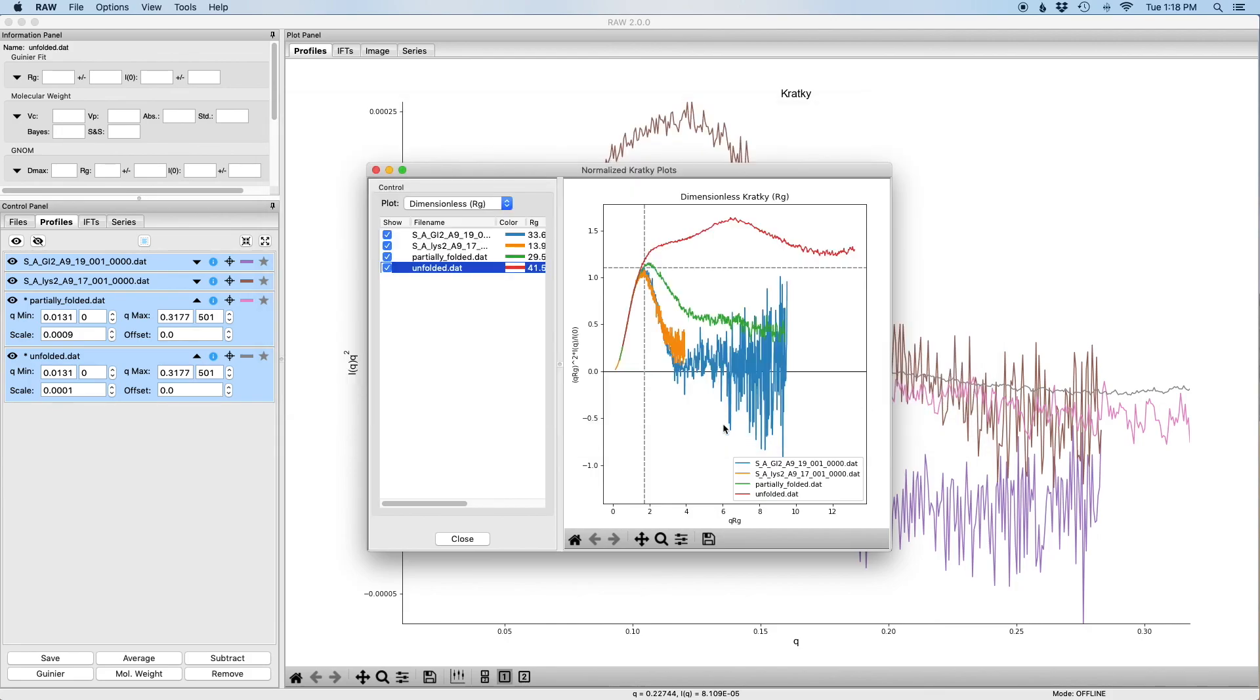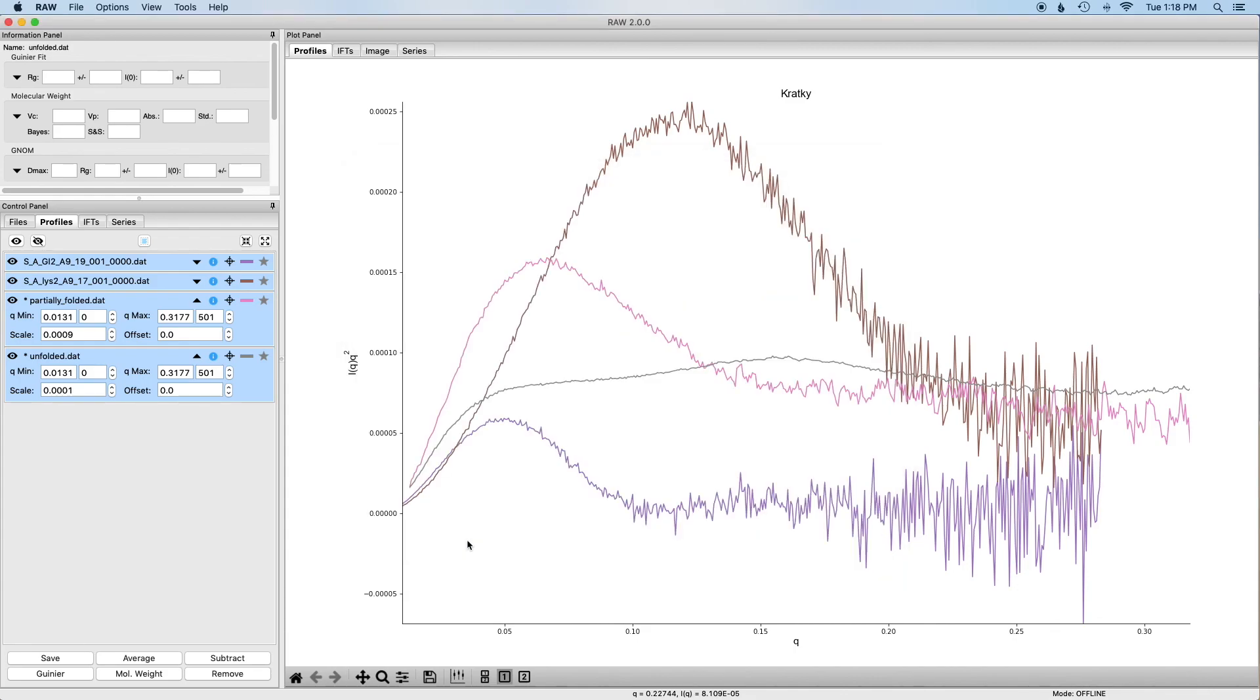And that will allow you to get these rescaled intensity curves without having to rescale them manually. Now I'm going to close the window. With that, that's the end of the tutorial. You should now know how to do Kratky and dimensionless Kratky plots in RAW.